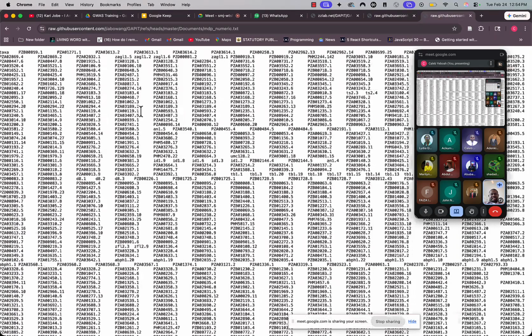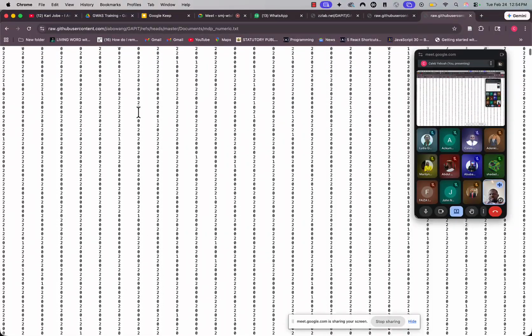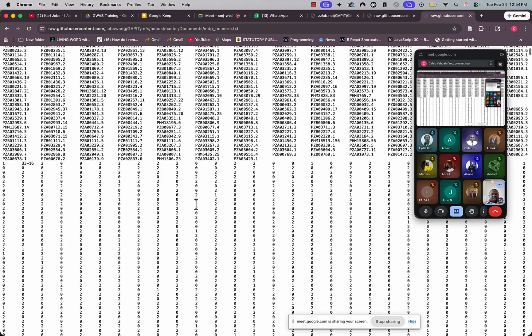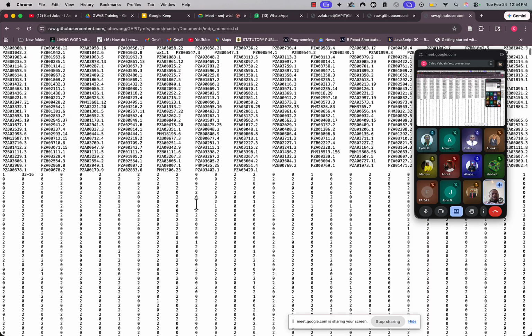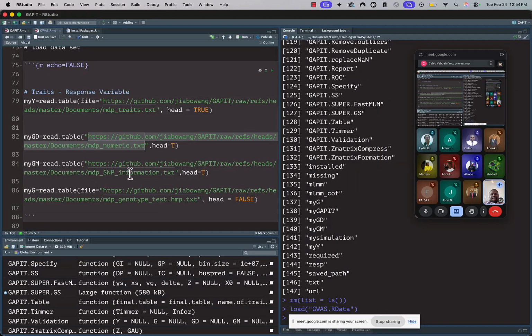This is a genetic data set. So you have the 2s and the 0s and the 1s. The AA, AT, GC we saw are usually coded into 1s and 0s, and then we can use those 1s and 0s to perform our analysis. You don't do that manually. Usually you have a script or a package to do that for you.